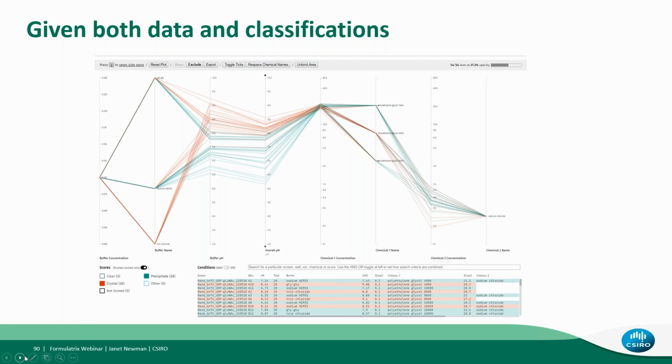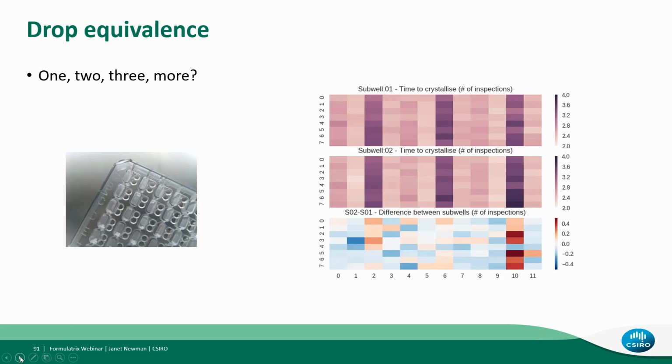And then, another thing that we've used our Marco scores for was we set up 2 subwell plates. And we've always been a little nervous about whether the time lapse between setting up drop number 1 in a 2 subwell plate or drop number 2 in a 2 subwell plate actually affects the results. What I'm showing you here is the Marco scores of our test plates where we set up lysozyme. We set up lysozyme test plates at least once a week.